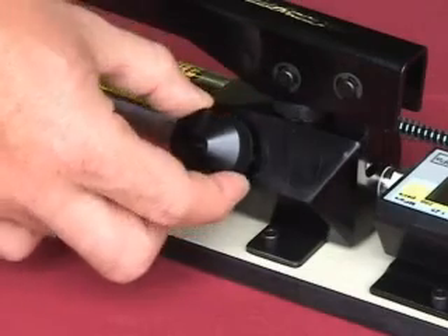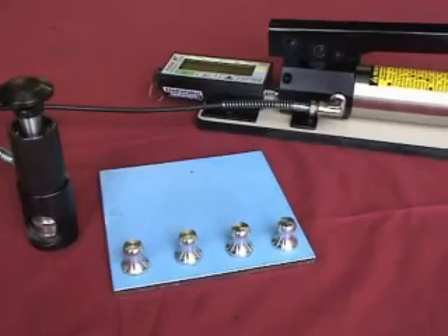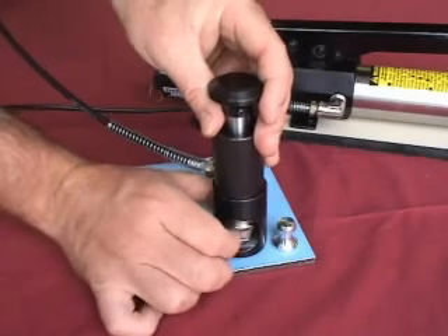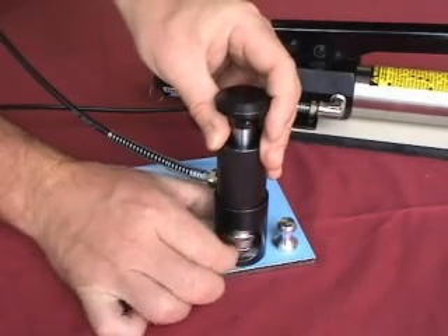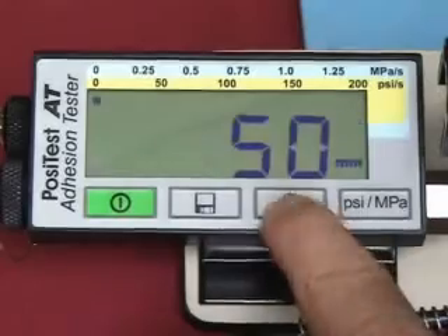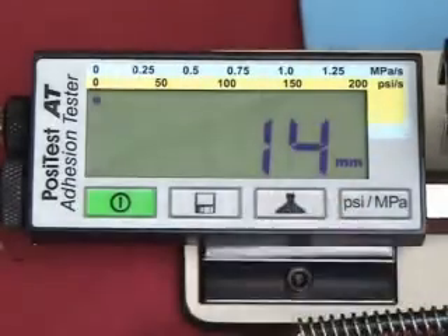Ensure the pressure relief valve on the pump is open. Place the actuator assembly over the dolly head. Attach the quick coupler to the dolly by reaching through the holes in the actuator assembly to lift the quick coupler. Release the quick coupling when the dolly head is completely engaged. Close the pressure valve on the pump tightly. Use the one-touch buttons to verify the dolly size to be tested and the measurement units.